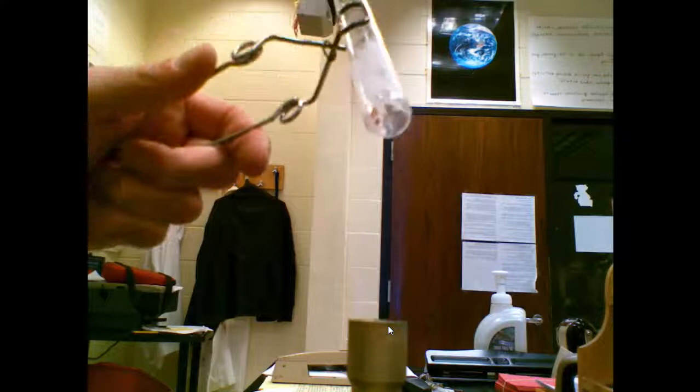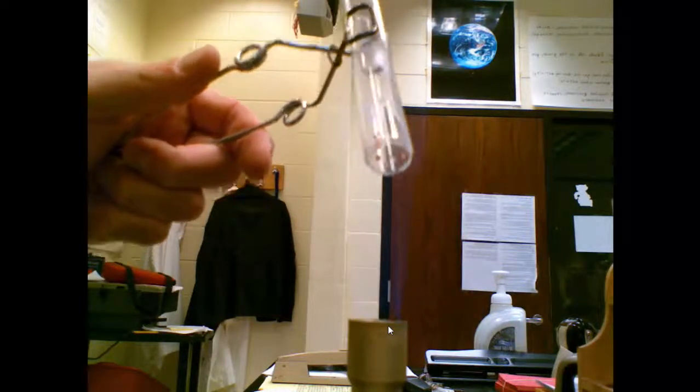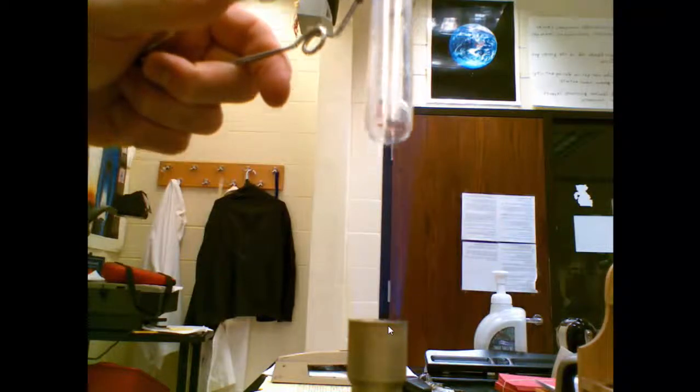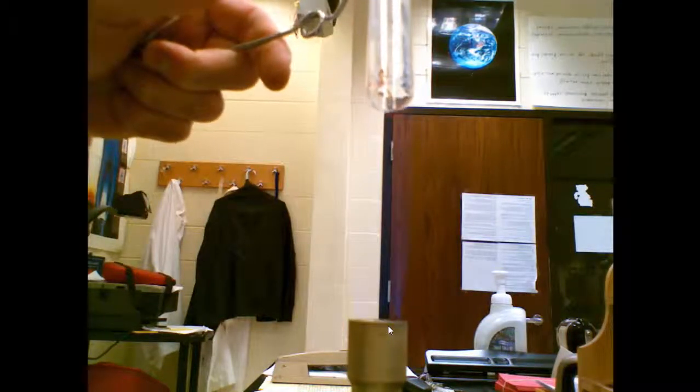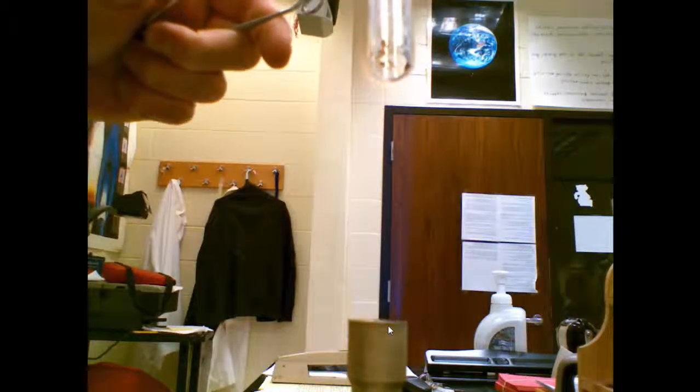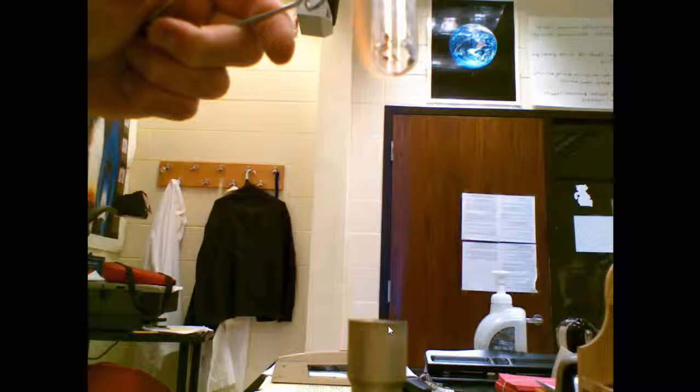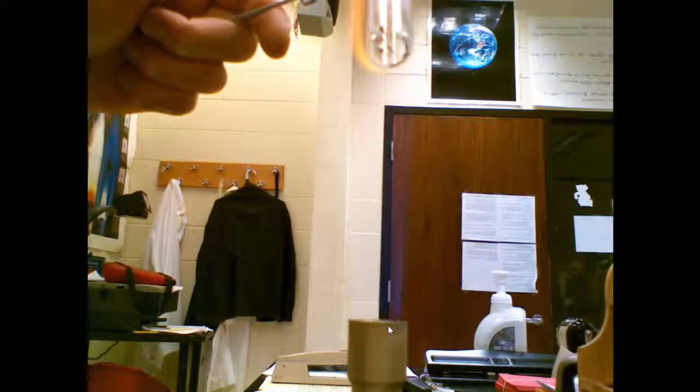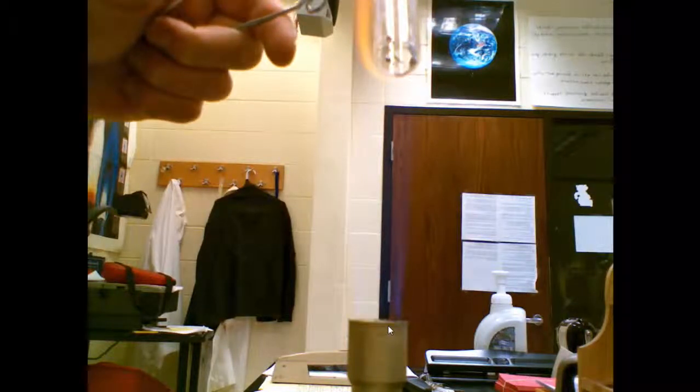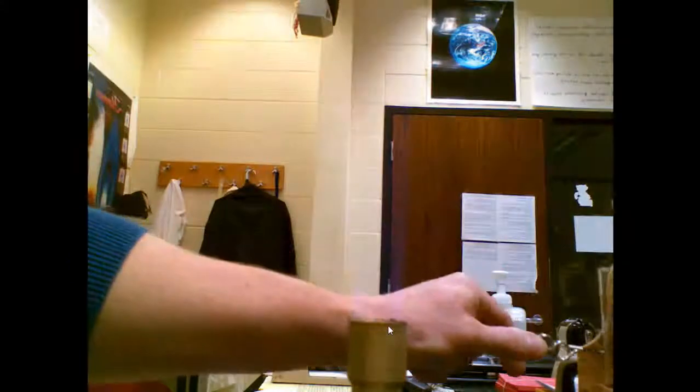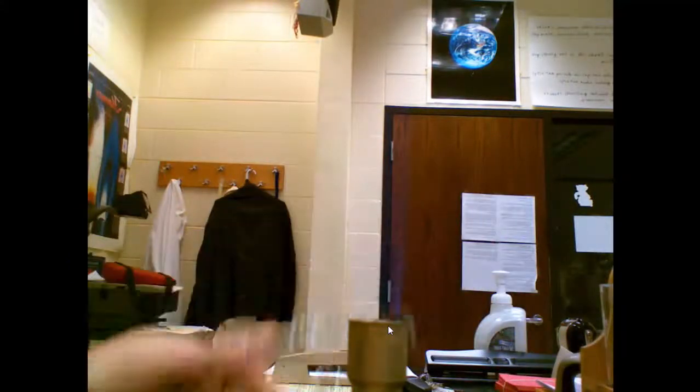So in the Bunsen burner, this crystal is not melting right away. The flame is starting to turn yellow. Still no melting. So this crystal does not melt inside our Bunsen burners. That would make that very high or greater than 500.